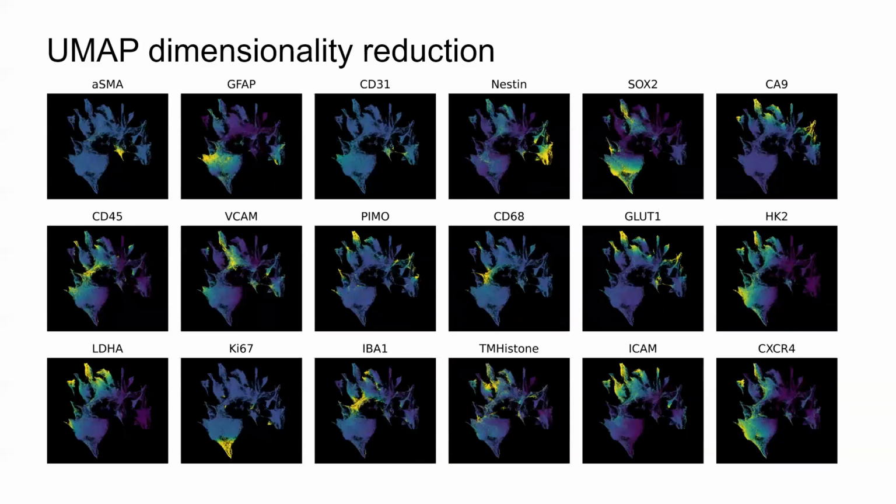Of course, we can also color them based on the marker intensity present. So, if we do end up seeing differences, well, we can figure out what markers visually are either overexpressed or underexpressed according to these different groupings.